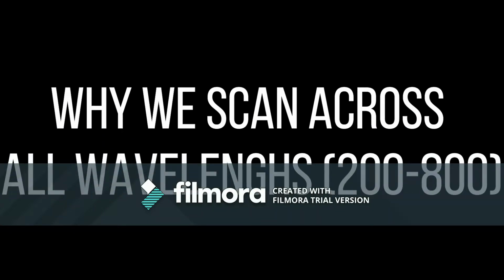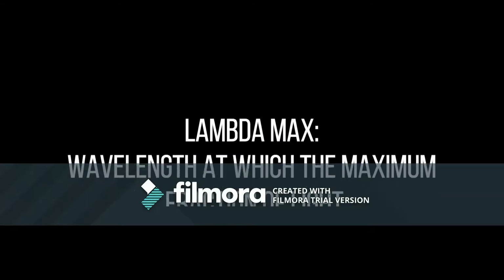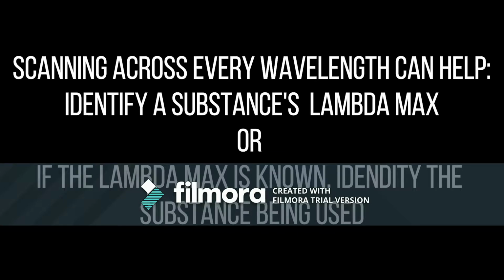Why we scan across all wavelengths. Every substance absorbs specific wavelengths and has a lambda max. Lambda max is the wavelength at which the maximum fraction of light is absorbed by a solution. Scanning across every wavelength can help identify a substance's lambda max, or, if the lambda max is known, identify the substance itself.